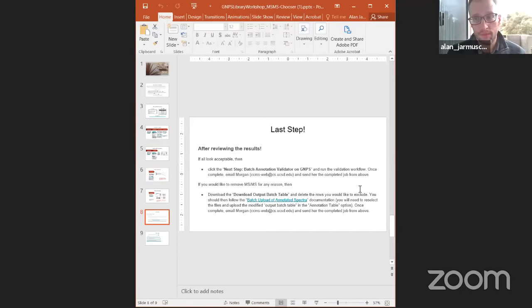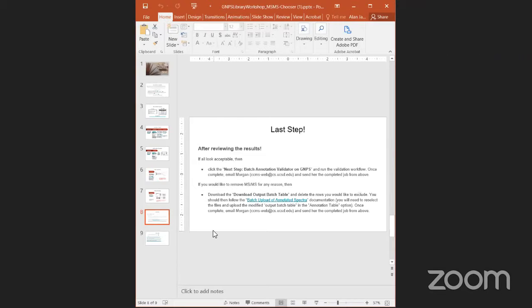I would say upload it because it gives people the ability to basically check. And they may agree or disagree with that structure. And again, it's fully editable. No one's going to criticize you for being incorrect. This is the point of the community getting at the correct answer eventually. Even if the structure is mostly correct, it's still helpful for the end user.